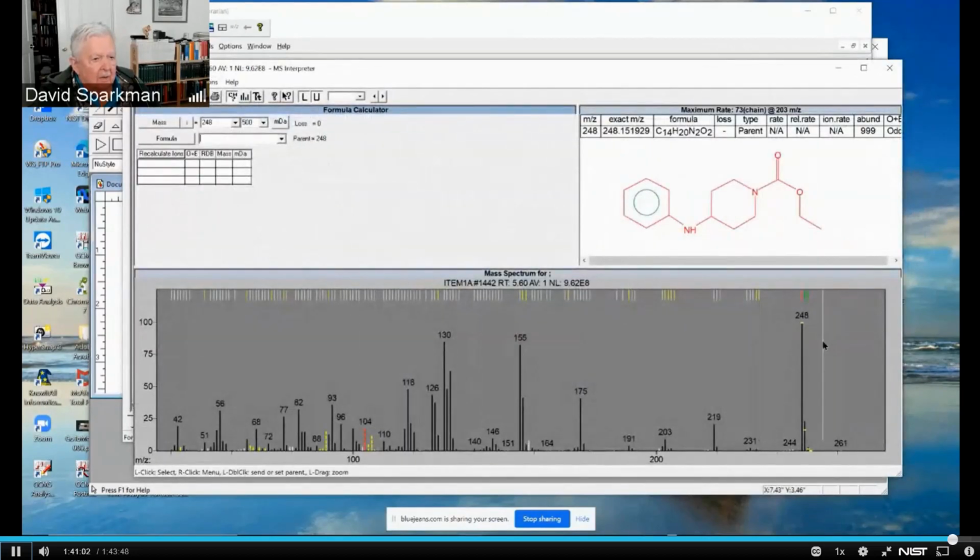And look at that. Look at how closely all of the peaks match for this as the possible structure. There's a little bit off on the isotope peaks. This red peak indicates that this is an ion that there is no method or rule for, so it can't be taken into account. But with the majority of the peaks here, I would say this was the correct answer.